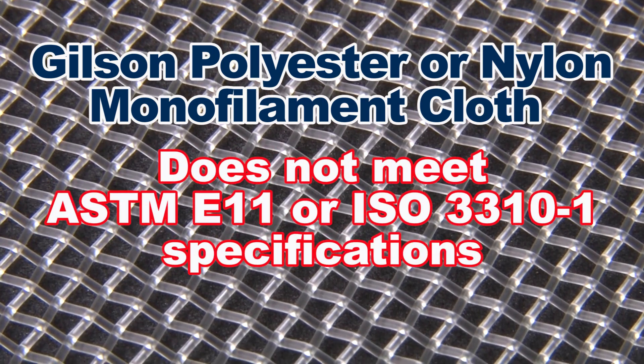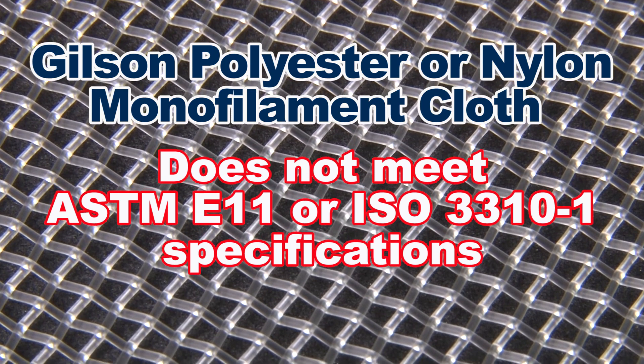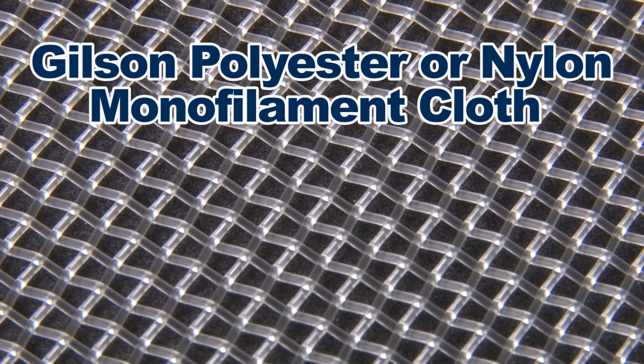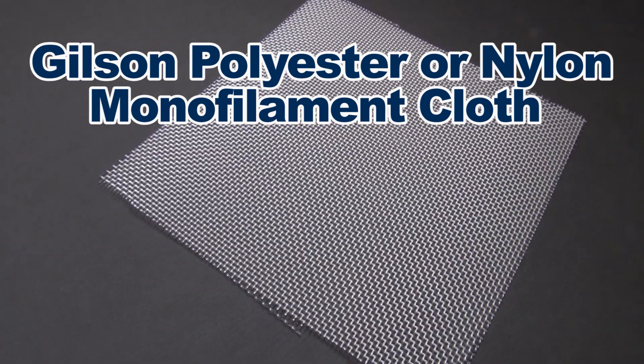The mesh does not meet ASTM E11 tolerances and should only be used when adherence to sieving standards is not critical. It is designed for specialized sizing applications where metal wire cloth cannot be used.